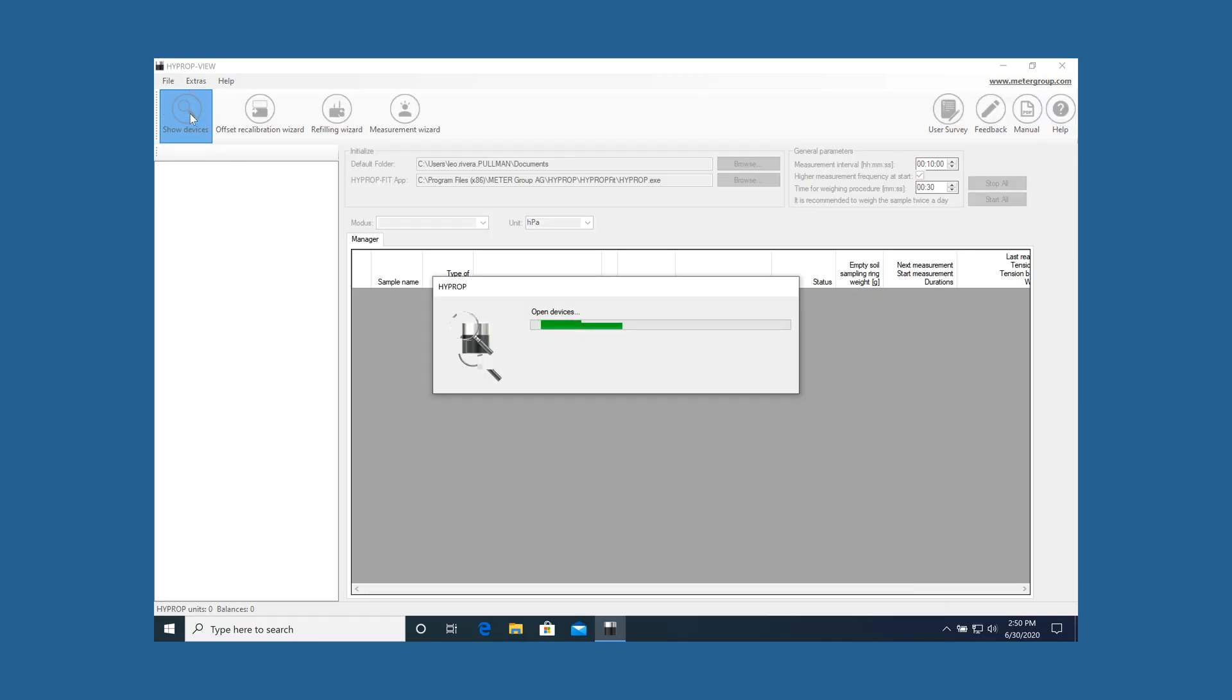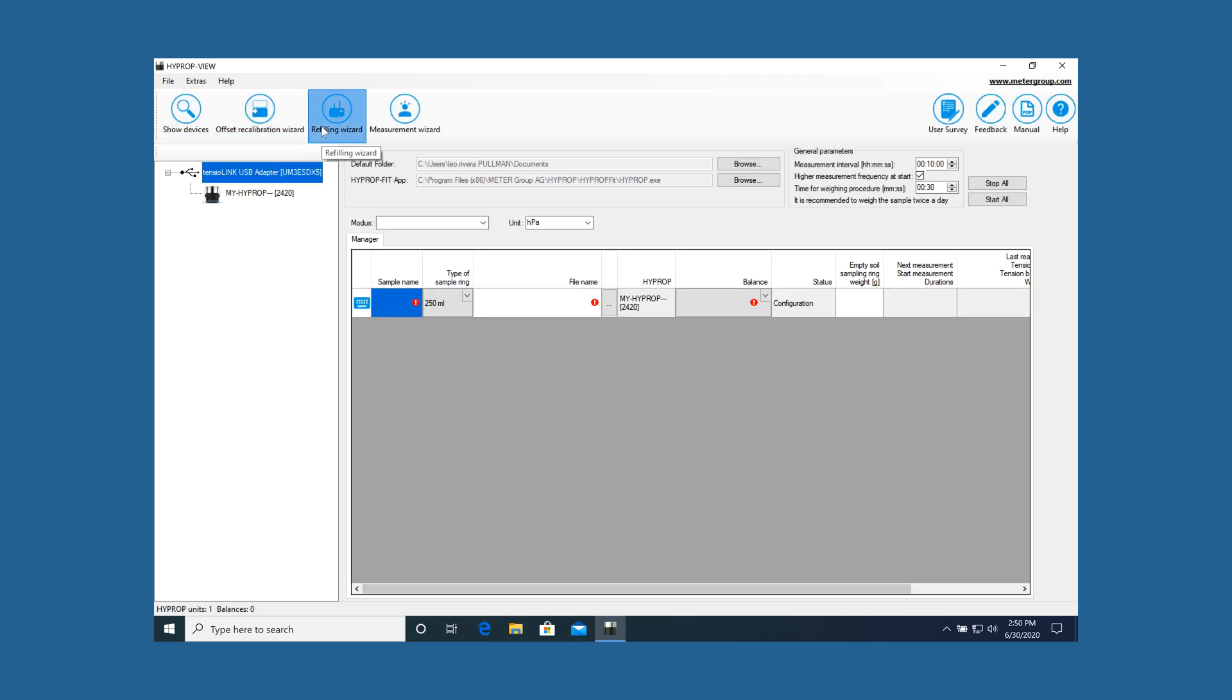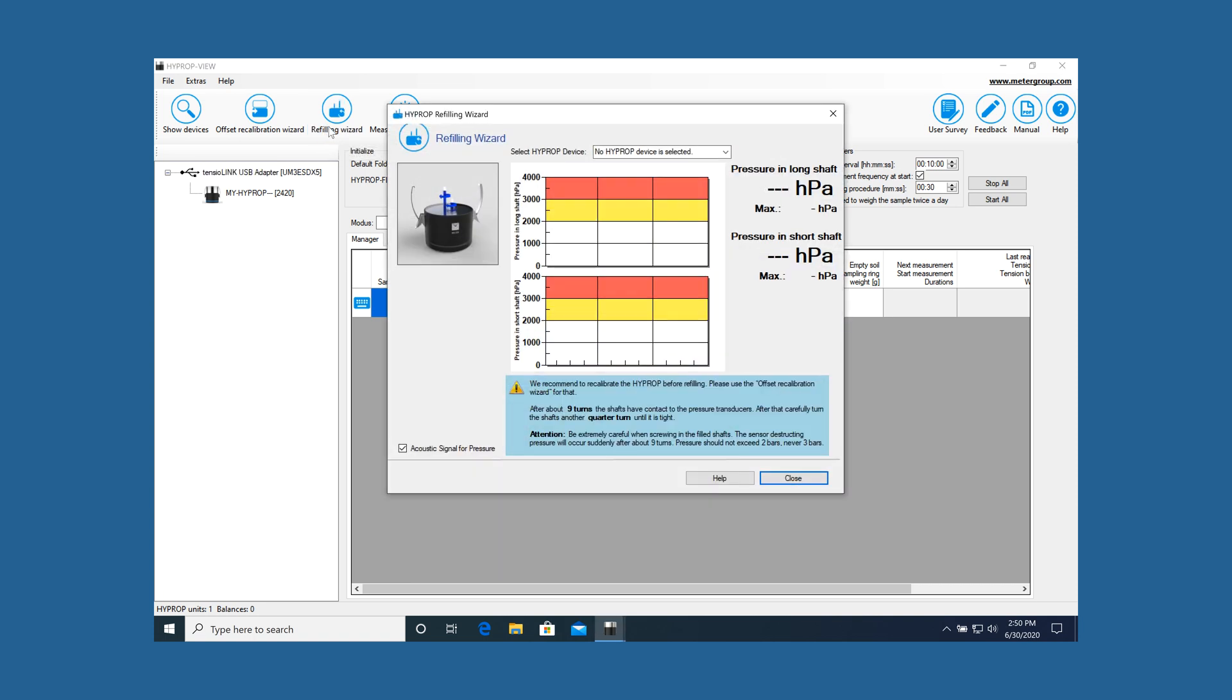Click on the Show Device icon. If you need to do an offset recalibration, see the manual for instructions. Click on the Refilling icon and follow the wizard.